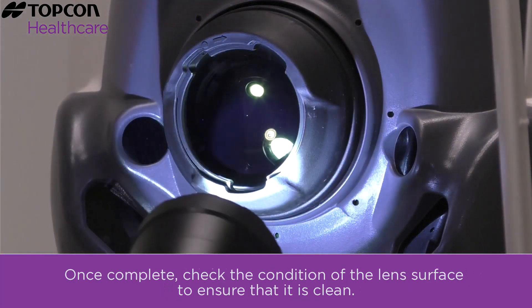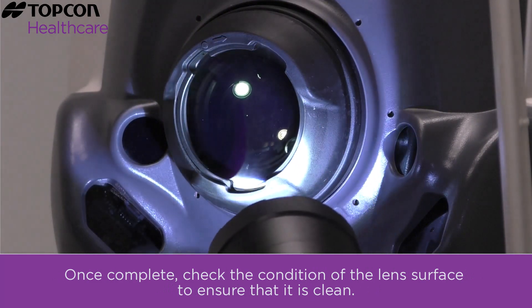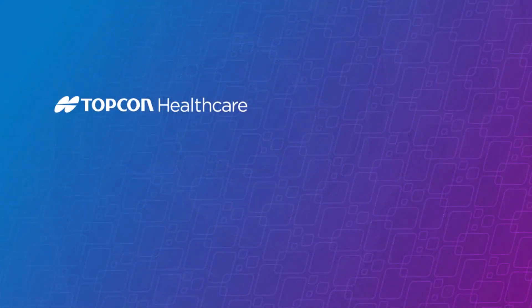Repeat the previous steps with a new moistened cotton wipe until the lens is properly cleaned. Once complete, check the condition of the lens surface to ensure that it is clean. If you have any questions, please contact your local TopCon distributor.